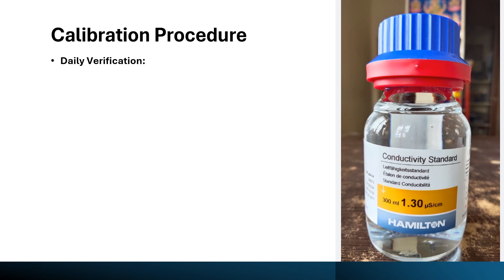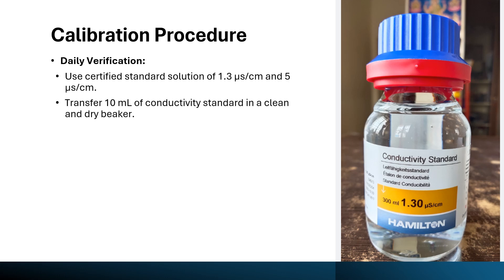First is daily verification. Prior to use of the conductivity meter, daily verification should be performed — this ensures the accuracy and reliability of your reading. Commercially available standard solutions of 1.3 microsiemens per centimeter and 5 microsiemens per centimeter can be used for daily verification. For daily verification, transfer 10 ml of conductivity standard solution of 1.3 microsiemens per centimeter into a clean and dry beaker.